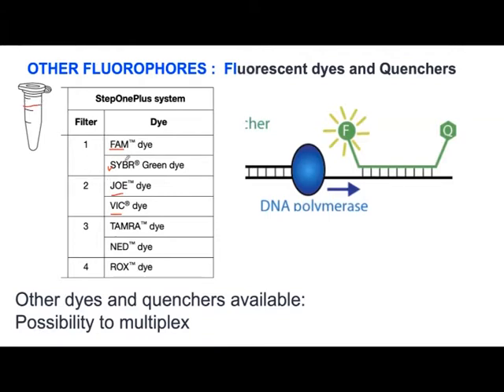But these molecules, unlike SYBR Green, fluoresce all the time. So all the time they are fluorescent. It's not like SYBR Green, which only fluoresces when you make the PCR double strand. These molecules, if you put them in the reaction, will always be shining color. So during PCR, if I'm plotting fluorescence against cycle number, they will always be high and will be at the same levels during each cycle.